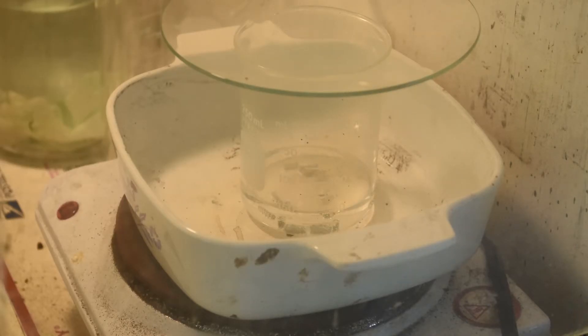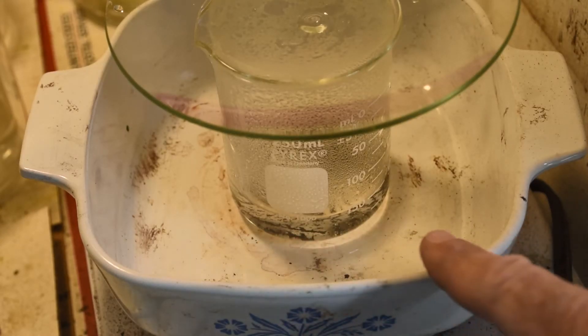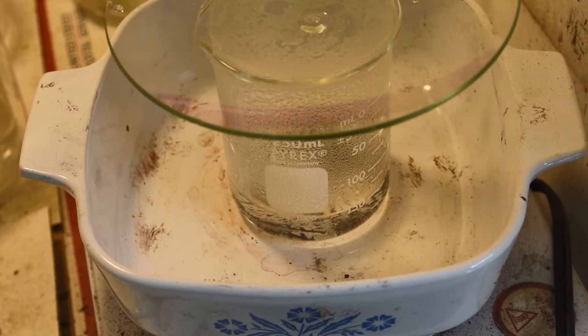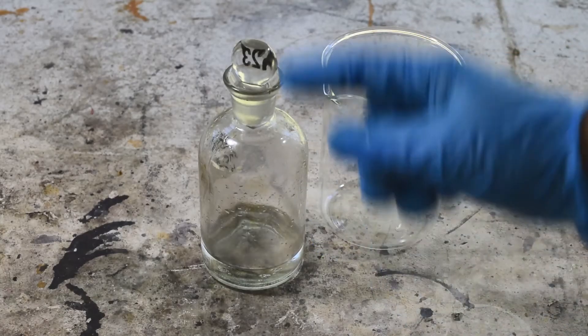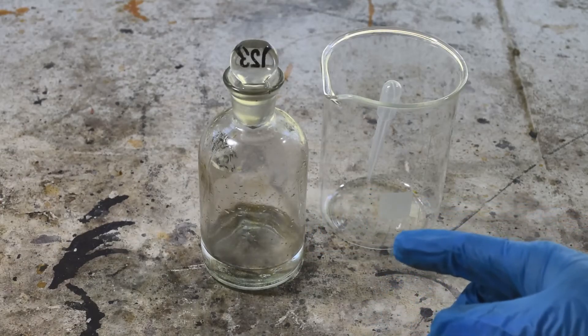After a few hours, the metal is all dissolved. There's that dark sediment I mentioned, but I'm not going to worry about it — this stuff works just fine with that sediment. I'll clean out my stannous chloride bottle, get rid of the old liquid that's been in there for a few weeks, and decant the new solution into it. For storage, I like to use a sealed bottle with a ground glass stopper to keep air and moisture out, which makes the solution last longer.